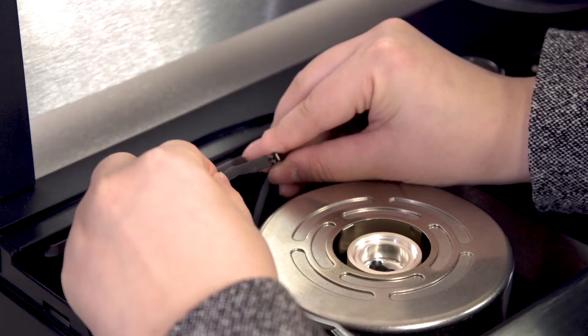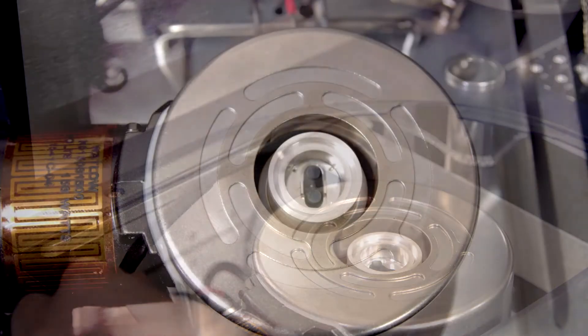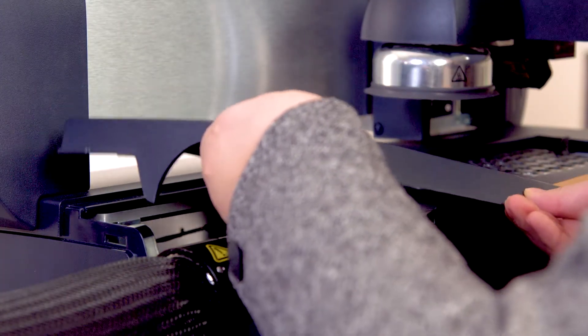Plug in the small connection cable for the cooling head heater. Make sure the DSC cell is sitting right in the center, then replace the top cover on the DSC.